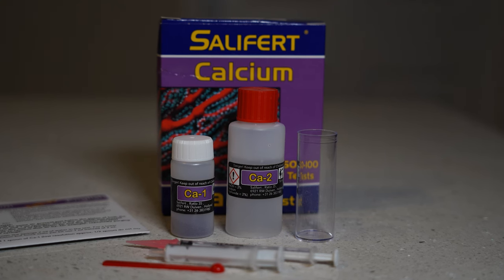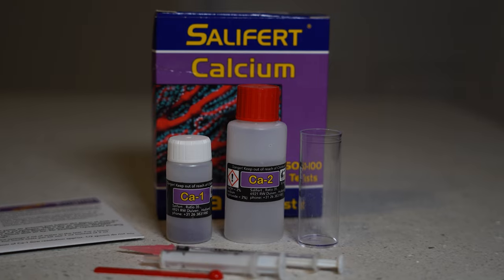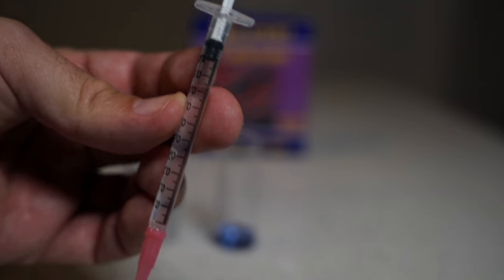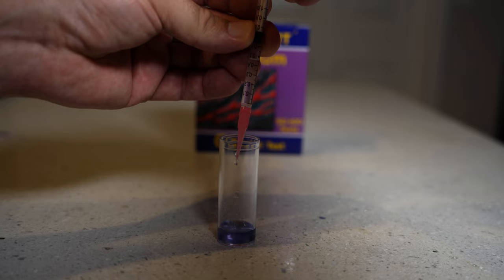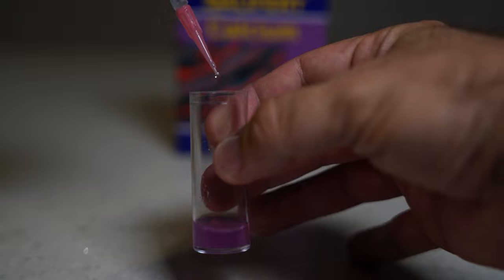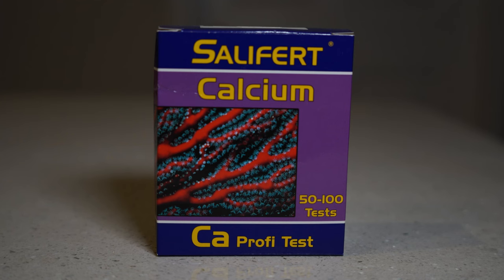For calcium I'm going with the Salifert test. If you've used this test before, you'll notice it's changed recently to a newer version with fewer steps. Fill the tube with two milliliters of the saltwater you're testing. Add one spoon of the CA-1, but don't mix it yet. Then get your syringe and fill it to the one milliliter mark with the CA-2 reagent. Put 0.6 milliliters of the reagent into the tube so the bottom of the syringe piston is at 0.4 milliliters. Swirl for five seconds so you see a pink color. Then add one to two drops and swirl, looking for a change from pink to blue. My calcium is at 480 ppm — at Worldwide Corals we like to keep it between 440 and 480, so I'm right at the higher limit.